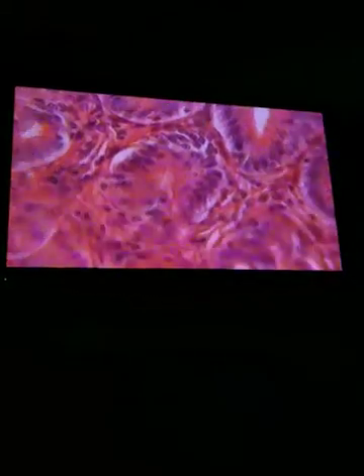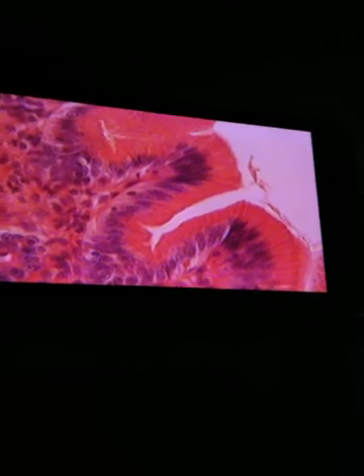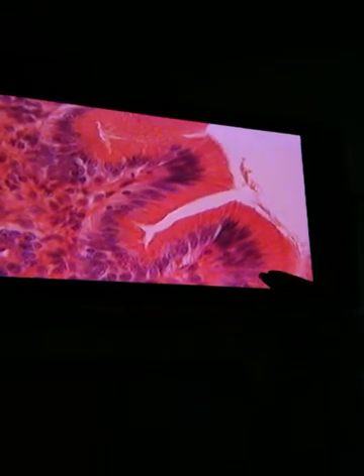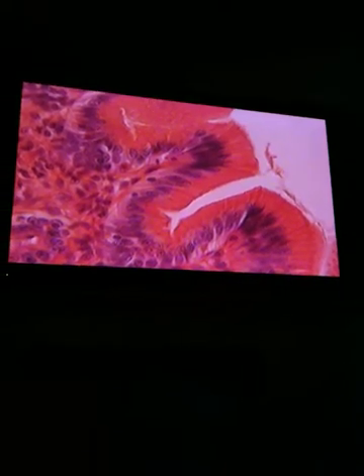What about the gastric glands? Gastric glands are going to be right below it. Let's see if we can see them. Okay, so when you're looking here, here's going to be a gastric pit. You still have simple columnar coming all the way around. The gastric glands are going to be down here to secrete whatever they're going to secrete, whether they're parietal or chief cells, and they line up along the sides. They've never really asked to pick out a chief cell or a parietal cell because it's virtually impossible to see the difference. But they could ask you what's at the bottom. They could be pointing right here and say, what is this item, and you'd say gastric pit. Okay?